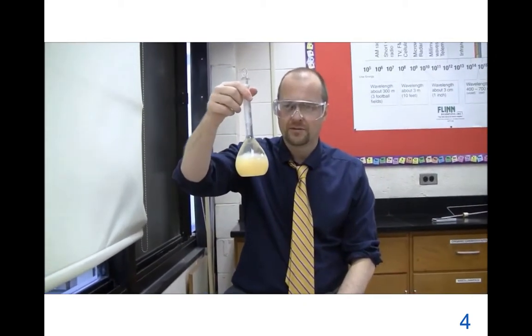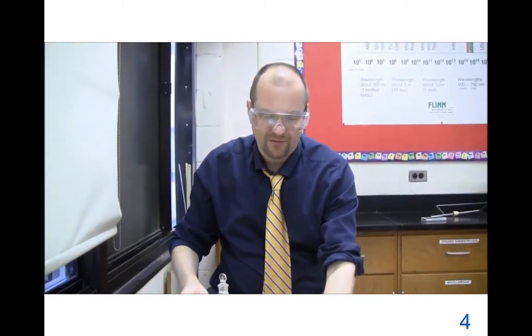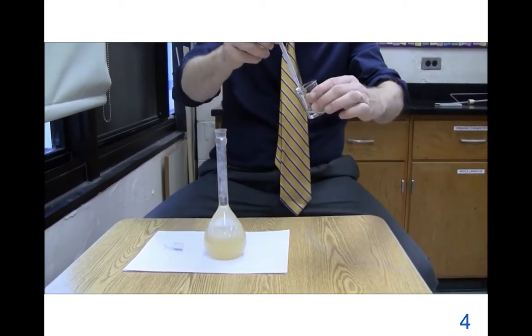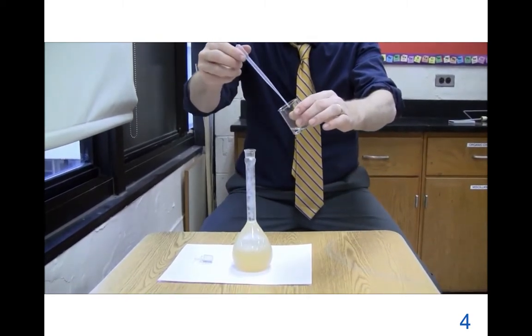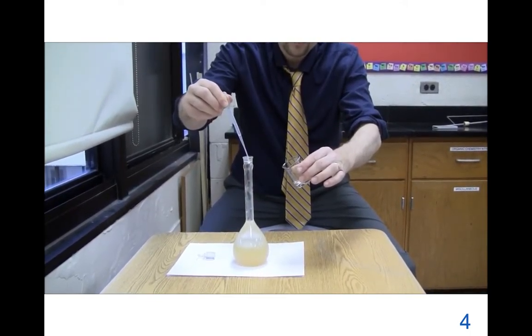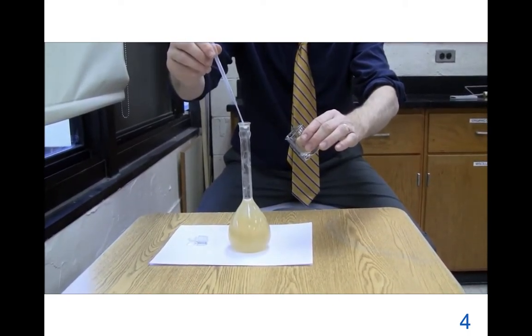Okay, so still no air bubbles, seems quite good. We had the manganese 4 ions here, which is kind of the brown manky colour. Now I have to reduce the pH for the next part to work. Carefully remove the stopper. And I'm going to add 2 milliliters of concentrated sulfuric acid. Move back a bit in case I spill it. That was just under 2. So this is an excess, doesn't have to be exact.